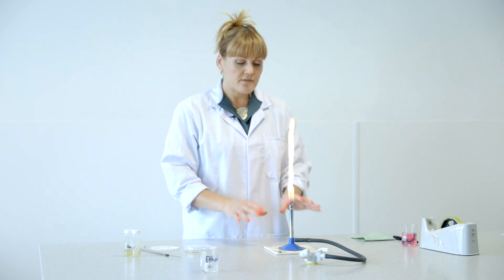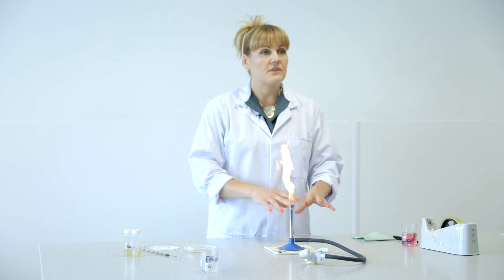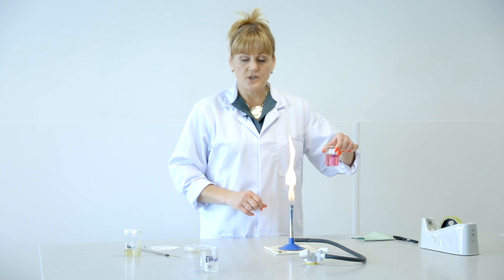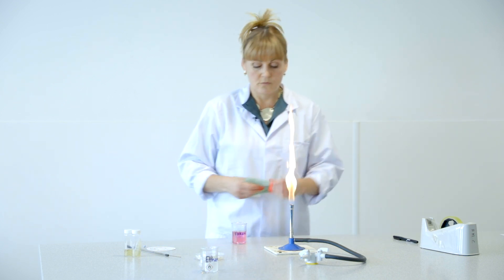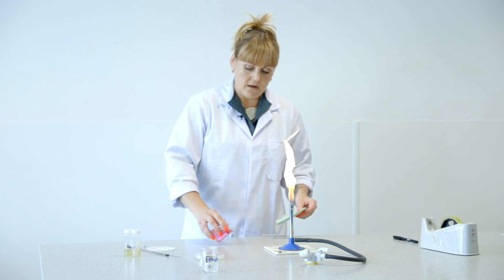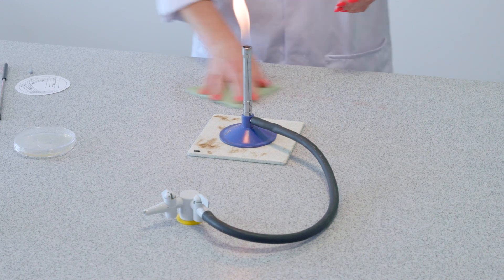You're going to have the Bunsen on the orange flame, which is a safety flame, and you're going to make sure that you've Virkoned the area. Virkon is the disinfectant that we use. This has been pre-cleaned, but I'm just going to show you what you would do — pour a little Virkon around your workstation and then disinfect the area.